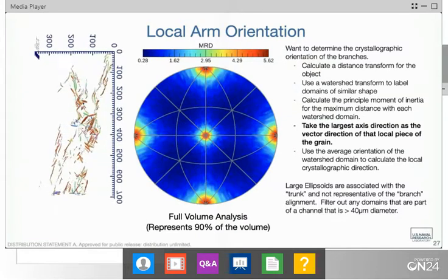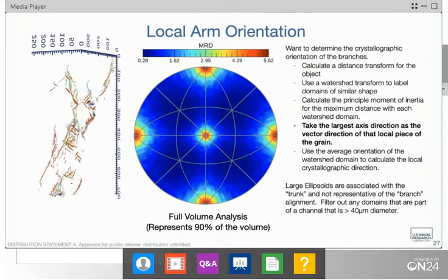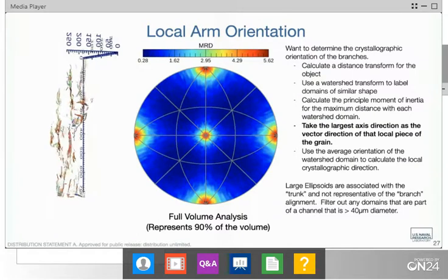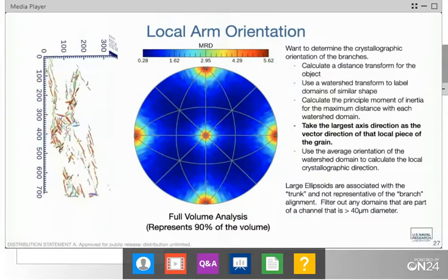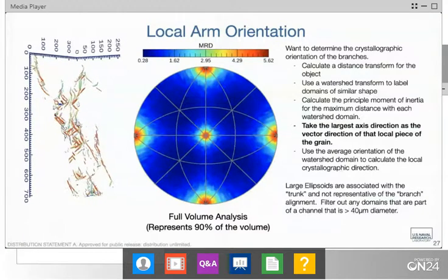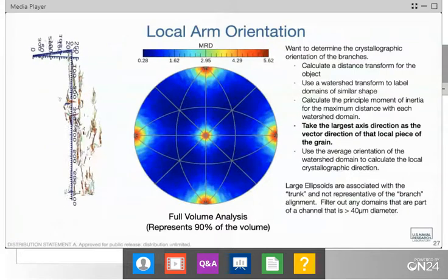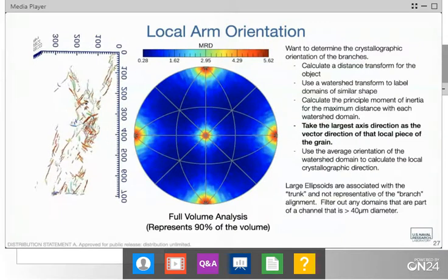Hall-Petch is really based on space-filling, nice equiaxed grains. Here, we could do a very easy measurement of average distance to an interface. It requires reformulating things a little, but it's not that hard to calculate. We can take every voxel within the structure and ask what its minimum distance to an interface is. I think that might be really advantageous.